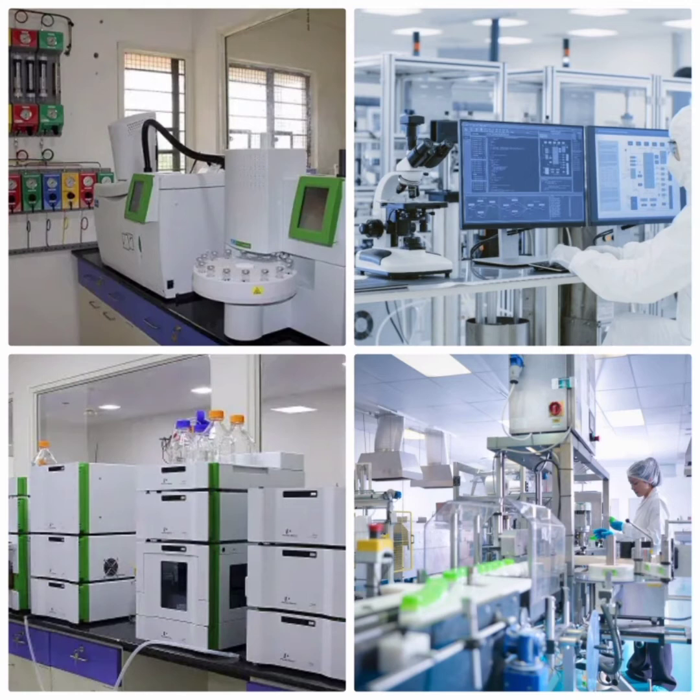What happens to resolution in the two techniques? If your sample is a mixture, bear in mind that resolution, which is a measurement of how well two peaks are separated, is affected by a number of factors. But it comes down to how similar the partitioning equilibrium between mobile phase and the stationary phase is for the two compounds.